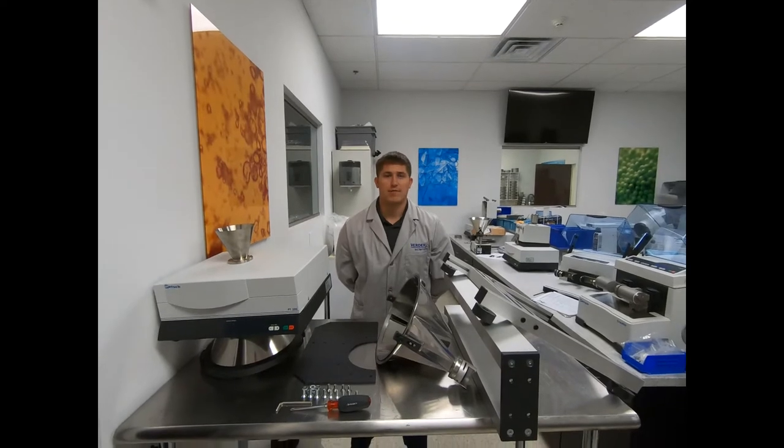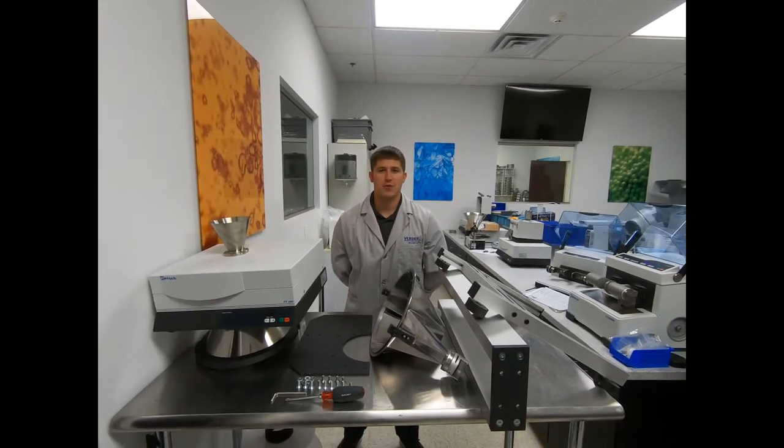Today I'll be taking you through the steps on how to fully configure our PT200 sample divider.